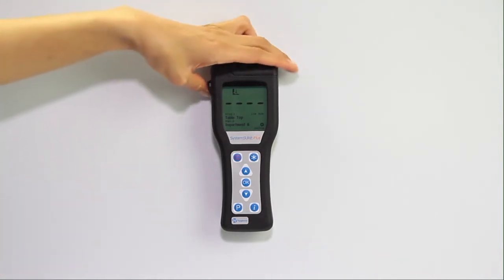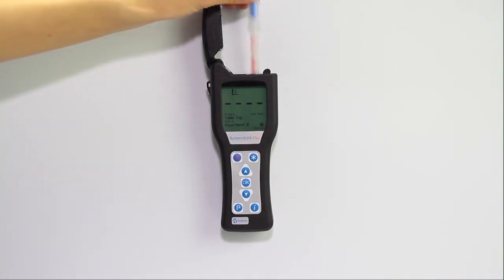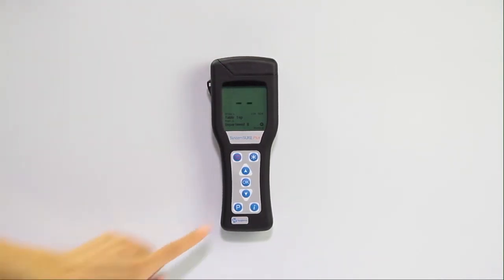Swab the area, insert the device in the meter, then select OK to run a test. Hold the meter upright until the result is obtained.